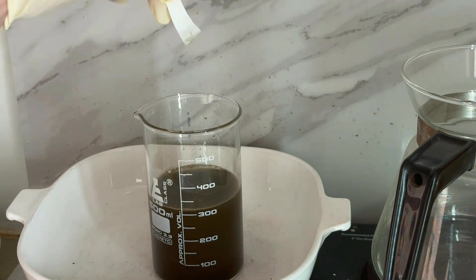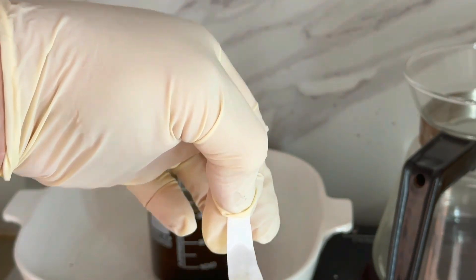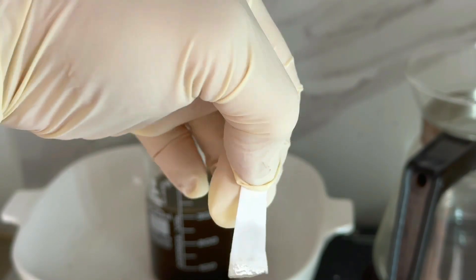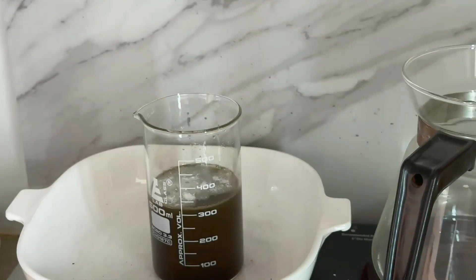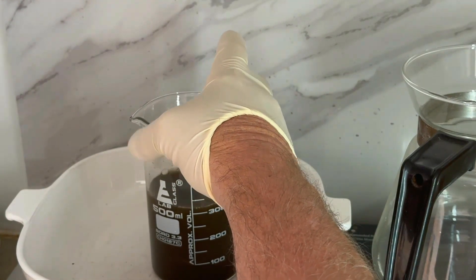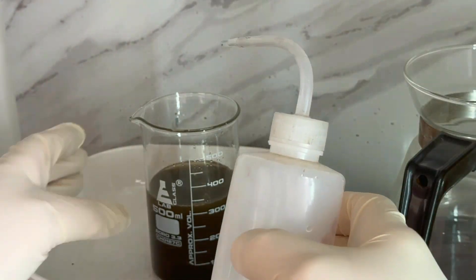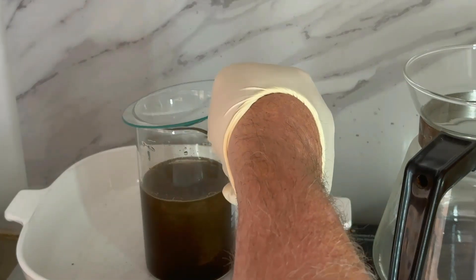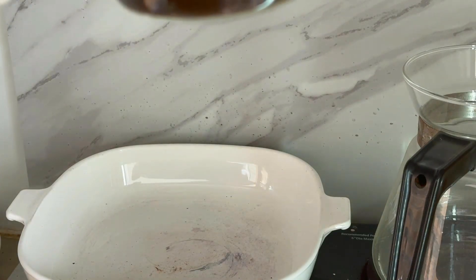I'll do a quick stannous chloride test — that looks negative. I'll add a little more SMB just for good measure, but I believe we have all our gold out of solution. Now I'm going to cover it and put it on low heat — heat drives off the excess SO₂ gas and helps it settle faster, both by driving that gas off and by getting the little particles to clump together and settle down so we can move on to washing, drying, and weighing the gold.